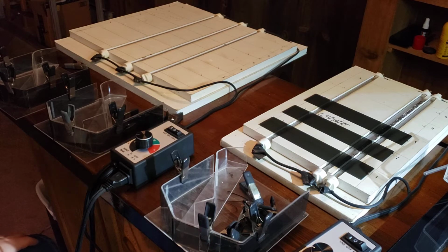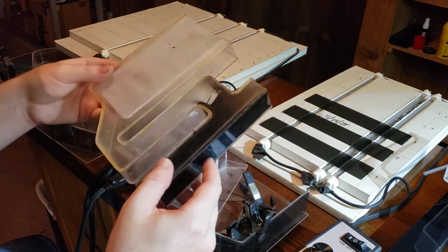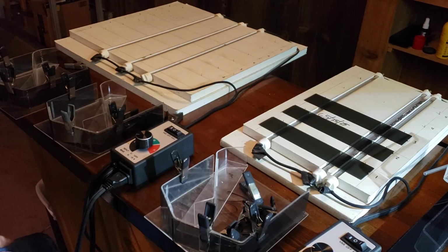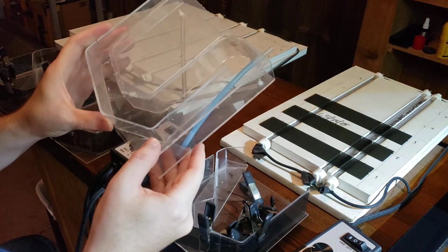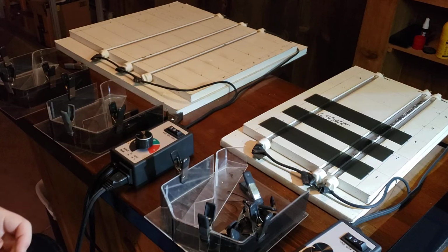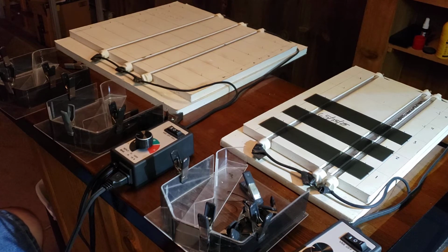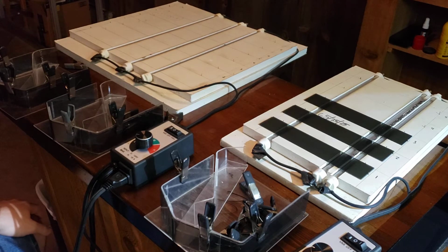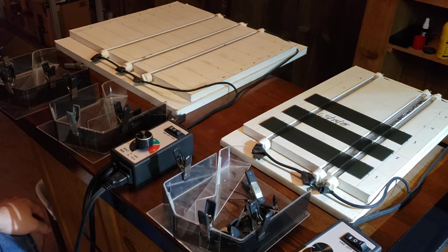When I first started making these, each of these bends I did over a candle. It was very labor intensive. Took me forever. Actually, I think this one right here is one that I made using a candle as well. Kind of hard to tell for sure. Ever since I made these heating jigs, it has really sped things up. I can actually heat 5 to 6 strips at a time. But I've only got 3 templates right now, so that's kind of what I stick with.